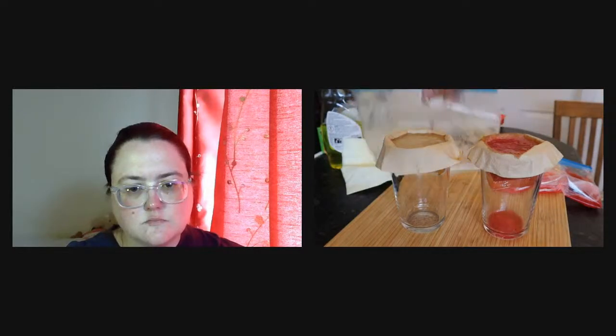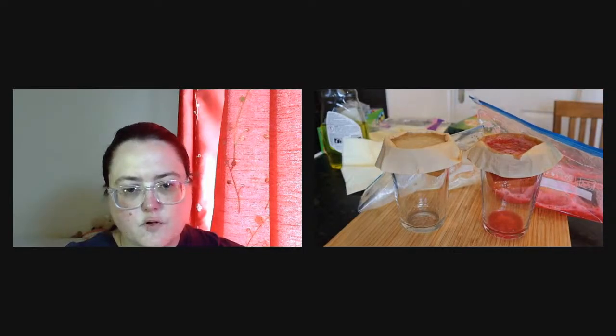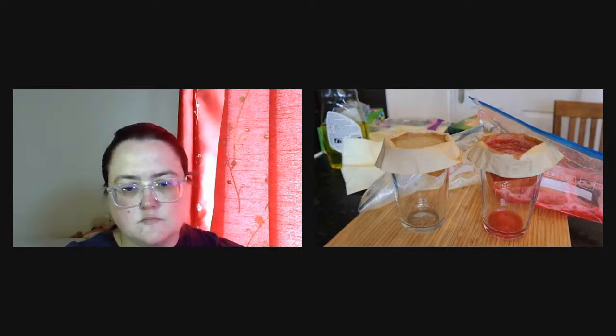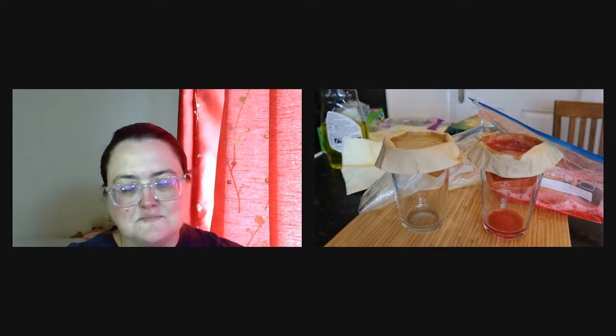And now we need to be patient. So usually the filtering takes a good 10 minutes or so. So maybe it's a good time for you, Claire, to tell us about what you do in the lab.